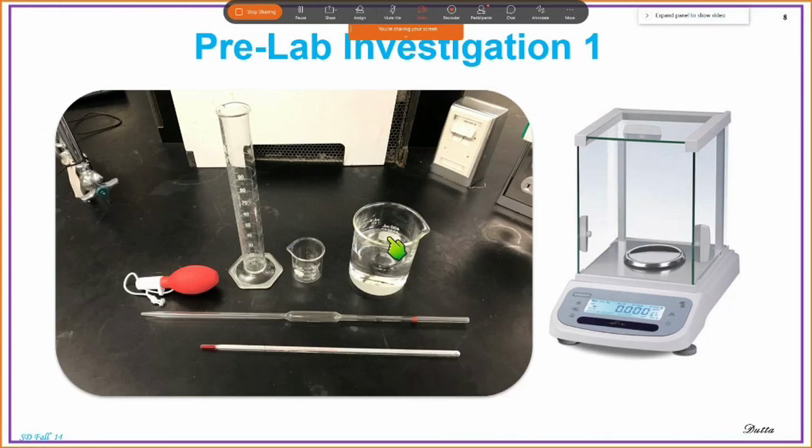Now when I say grab some water, you will see around the lab there are sinks. And each sink has 3 things: 2 faucets and 1 sprayer for eye wash. And I will show you tomorrow. So of the 2 faucets, one of them is white. That will give you distilled water, pure water. You know that regular water is not pure because it has minerals. So you don't want to take the water with minerals because we will be using pure distilled water. So you grab some water.